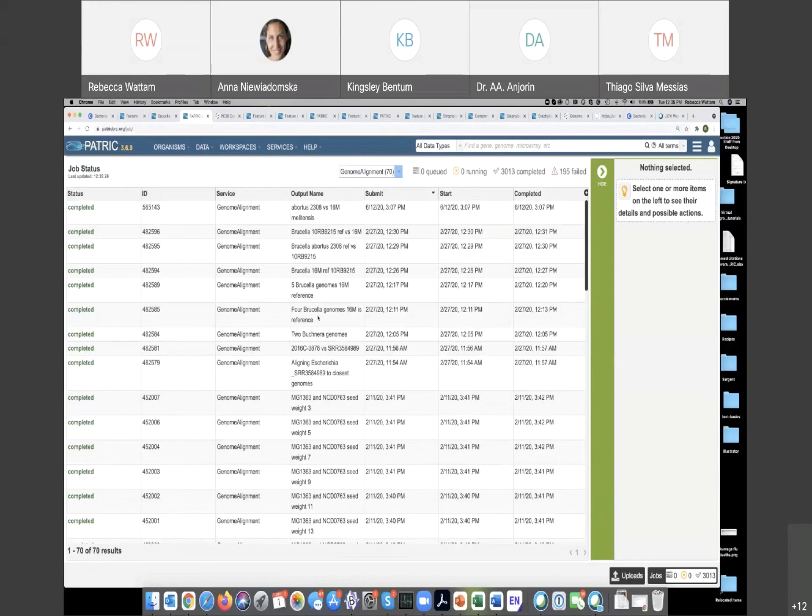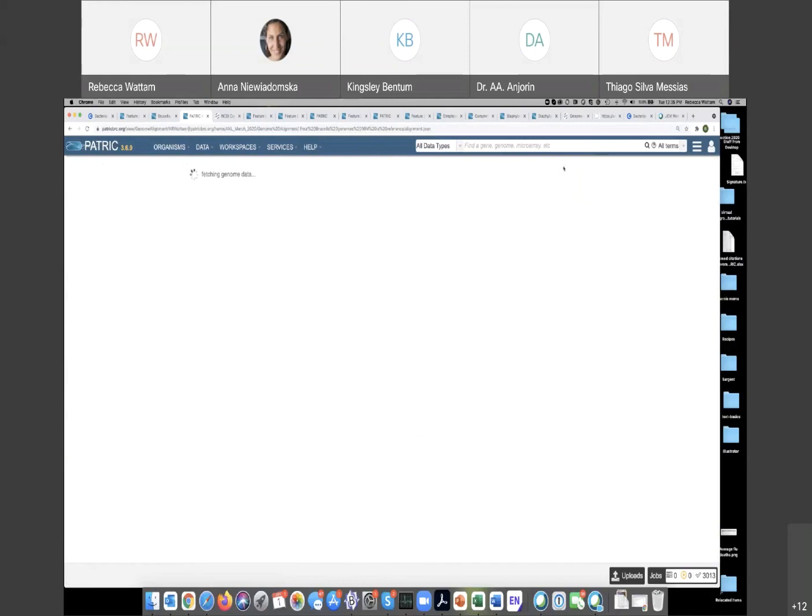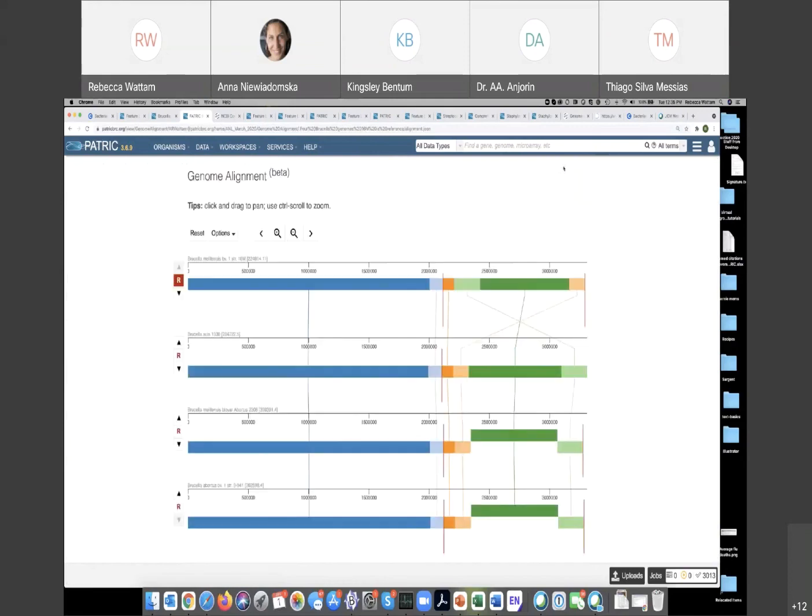Let's see what this looks like. And then just want to view it. Oh, isn't that pretty? Just love that one. So if you knew what the plasmid was, and let's say I used the plasmid for that, then you would know exactly which of those contigs in your genome were that. Also, there are specific genes you can look for that identify a plasmid, but sorry, it escapes me right now what exactly those all are.